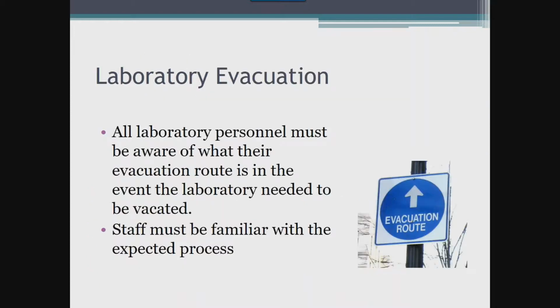Facilities that we work with are so big and have so many different entrances, floors, hallways, doors, etc., that it is critical that an evacuation route has been identified and that staff know what it is. With buildings being added onto during construction, departments relocating, and staff transferring throughout the facilities, changes in evacuation routes are common as related to the staff. Awareness of your routes reduces your risks of getting caught in the building because that route has been determined to be the quickest exit for the location of your workspace. Make sure you know what it is.